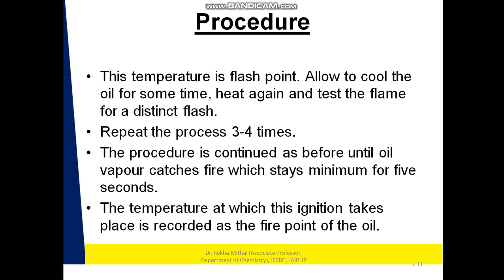Allow the oil to cool for some time. Heat again and test the flame for a distinct flash. Repeat the procedure 3-4 times. The procedure is continued as before until the oil vapor catches fire, which stays for a minimum of 5 seconds. The temperature at which this ignition takes place is recorded as the fire point of the oil. So now we'll start the experiment in the laboratory.